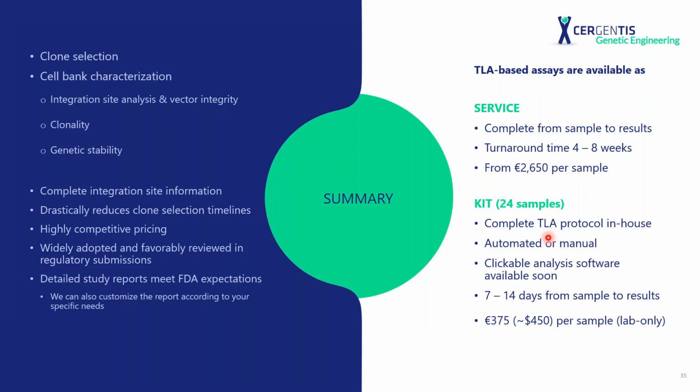And just to summarize, TLA can be used in multiple stages of cell line development, including clone selection and cell bank characterization, providing genetic data about integration sites and vector integrity for clonality and genetic stability.